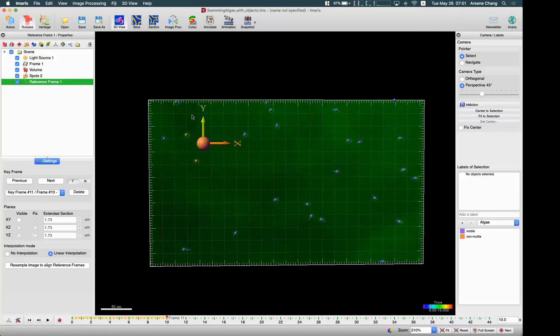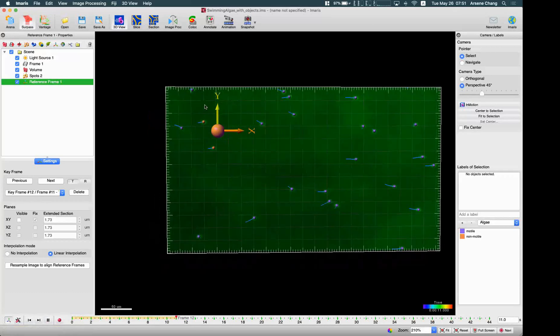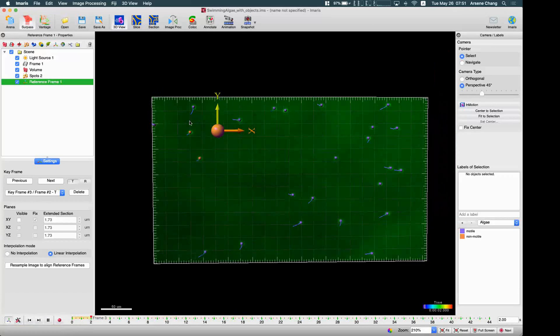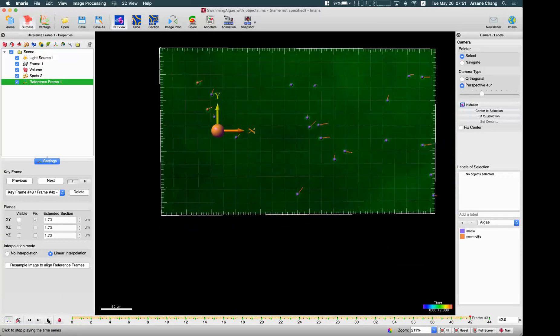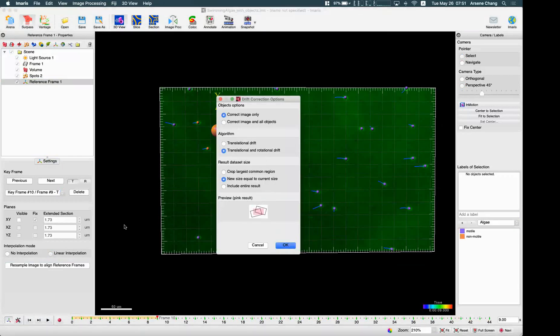But if I set the reference frame play mode using this button, then when I play the movie, you can see the whole image is moving along with the reference frame. So in the reference frame correction, you can correct this drift without touching the raw data, but also you can use this button to resample the image only. These two ways are kind of the same correction — it can be the same correction if you use this button to correct the image as well.